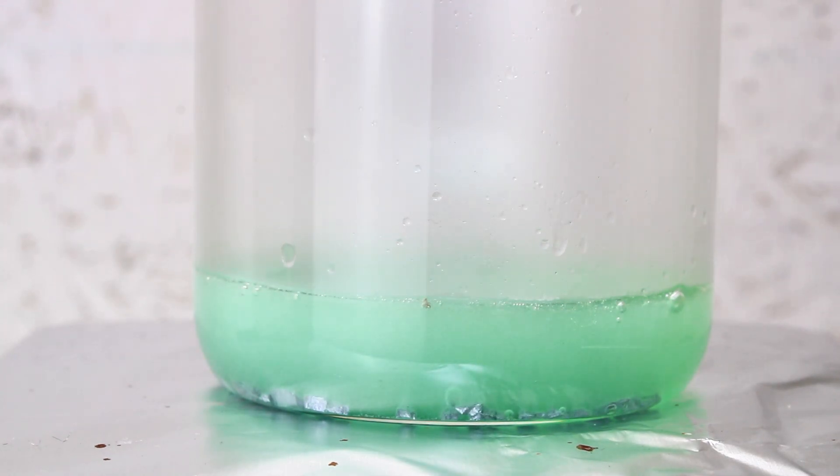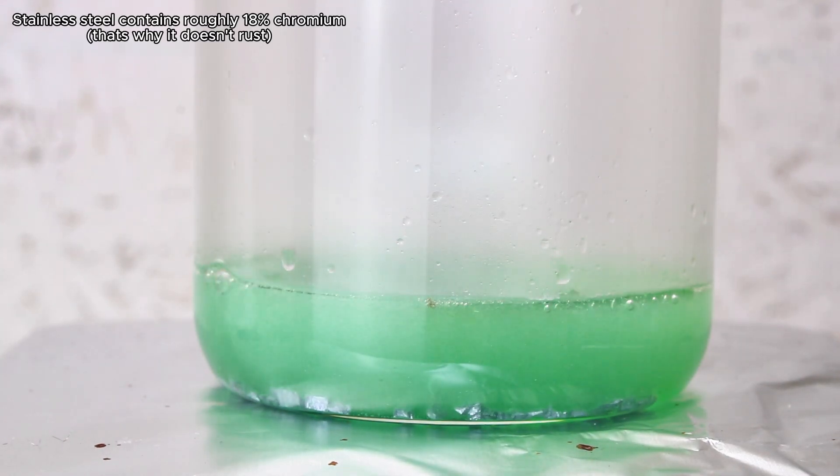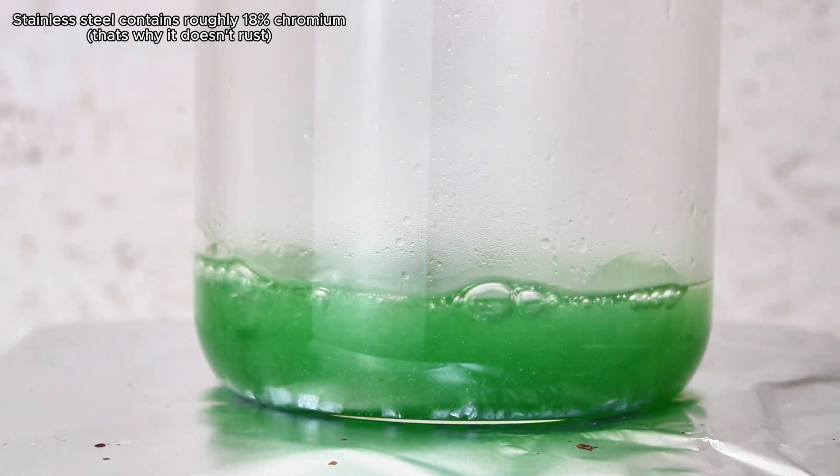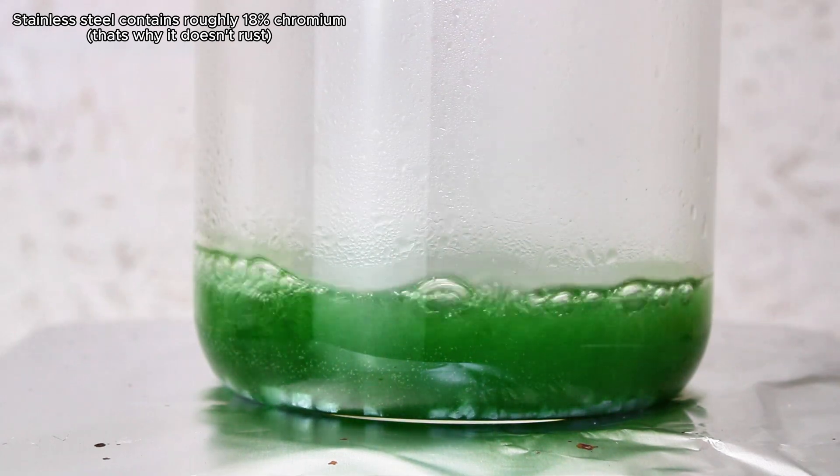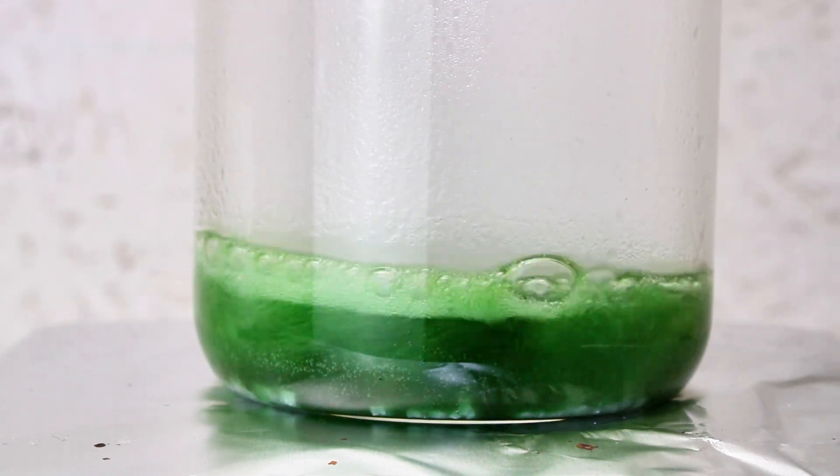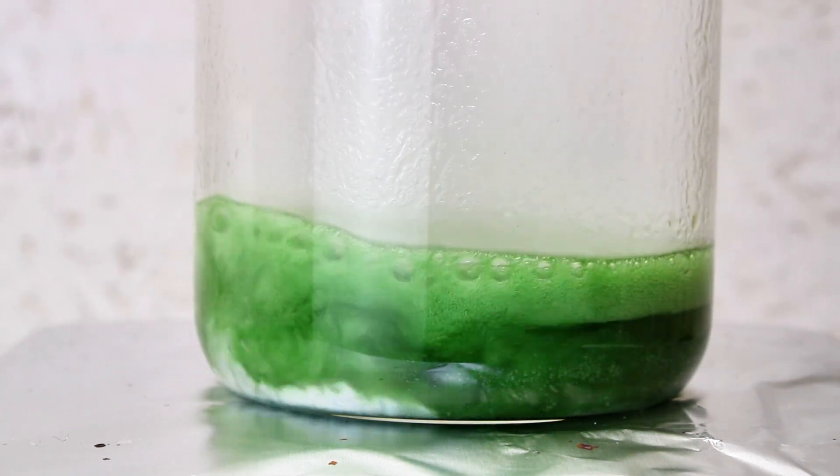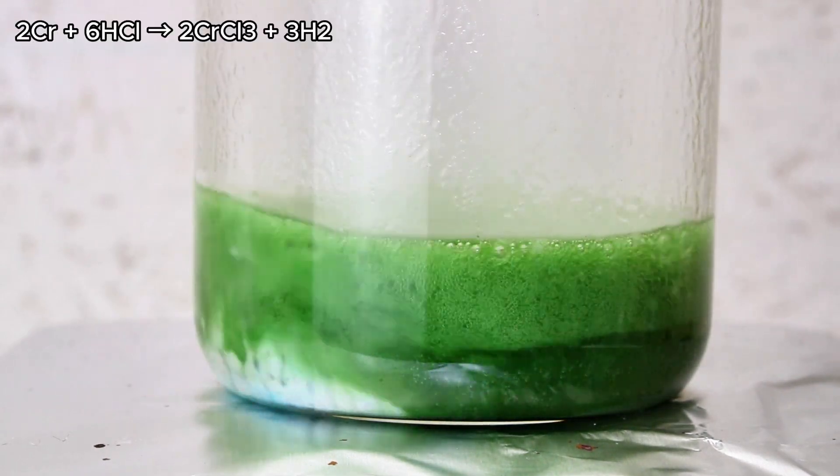The first thing that comes to mind would be like dissolving down some silverware in hydrochloric acid and then selectively precipitating the chromium, which I might do in a future video. In any case, chromium metal dissolves extremely readily in hydrochloric acid into the very dark green hydrated chromium 3 chloride.